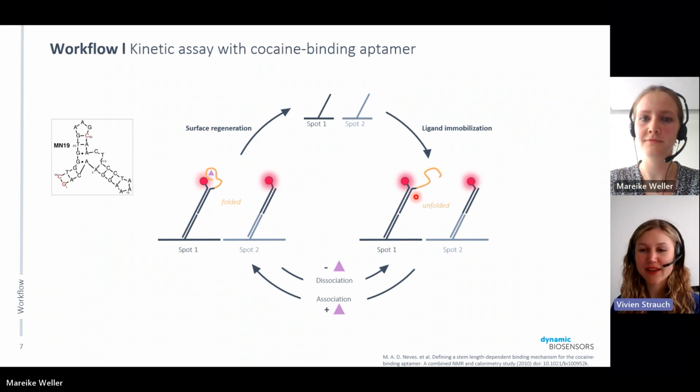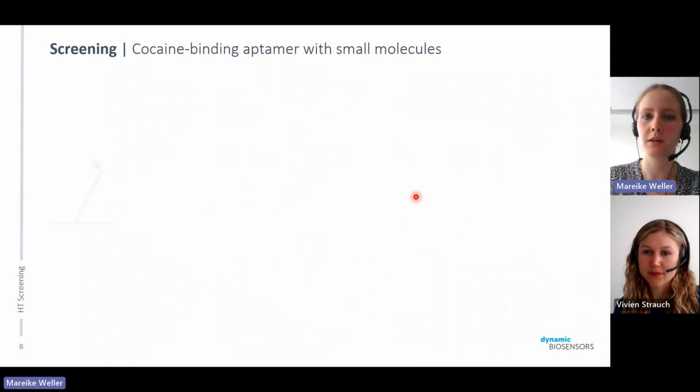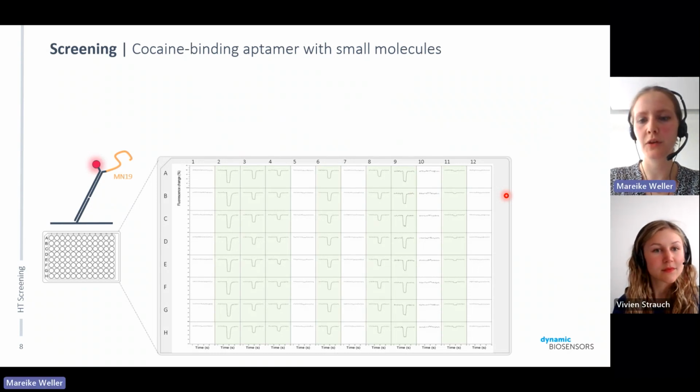Yeah, it's a very versatile setup, I think. And then the second question is about our measurement modes. So it's whether we can also observe the conformational change in the dynamic switching mode, because so far all measurements were performed in static mode, right? All measurements were done in static mode, and since I got all the nice screening, super fast with this mode, it was not necessary in this case to do conformational change measurements here with the switching mode.